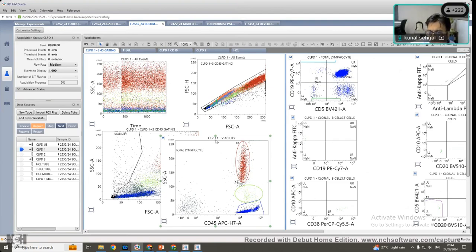So you have panels, morphology based panels if you use. You have an acute leukemia panel, a panel for lymphoma or chronic lymphoproliferative disorder, which is typically also directed towards mature B cells and or mature T cells. Then if you have a case of myeloma, you have a myeloma panel. If it's a case of residual disease, you have a minimal residual disease panel. Like I showed you lymphocyte subset, my panel was different. So every disease entity may have separate panels which have to be validated in your lab, and you should know what is normal in them first.